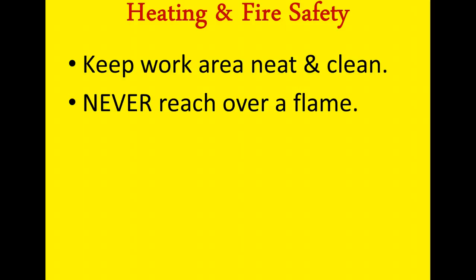Next, never, never, never reach over a flame to get something. Make sure that you always either walk around or go around with your arm to reach something that's on the other side of a flame. Please don't ever try reaching over to get something.